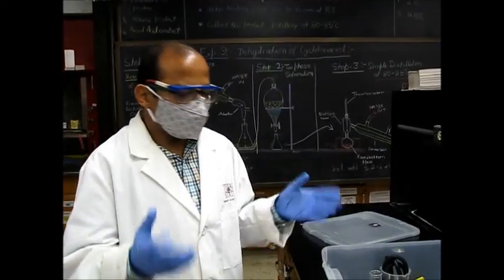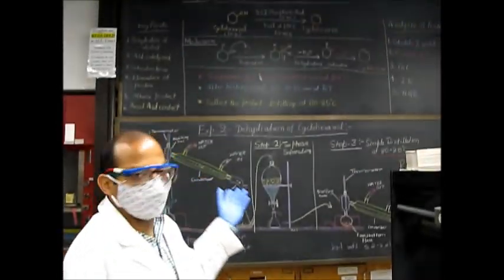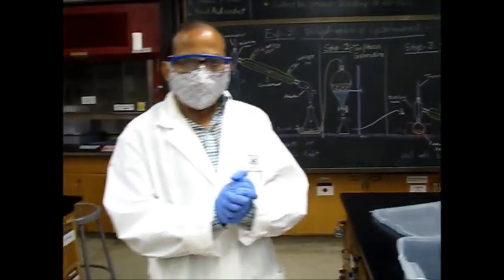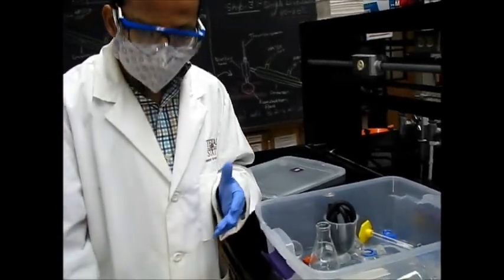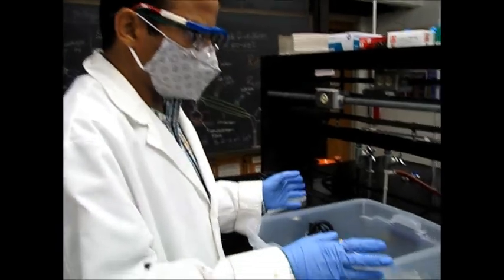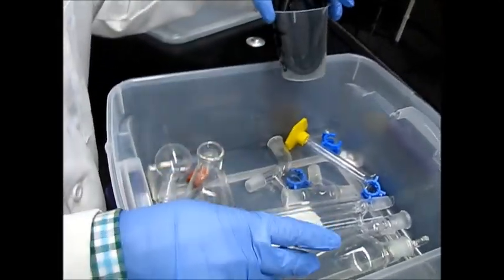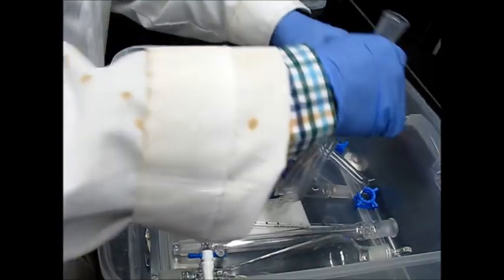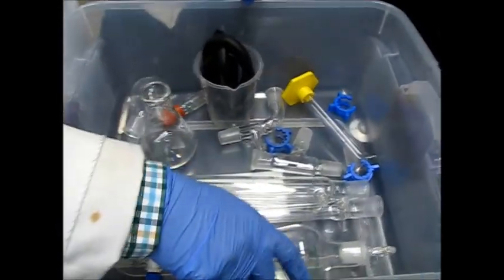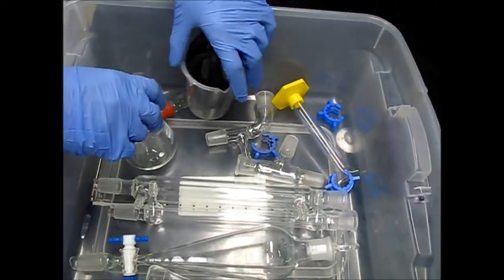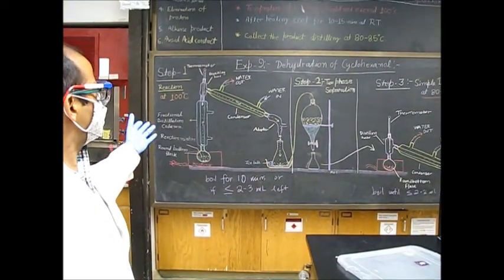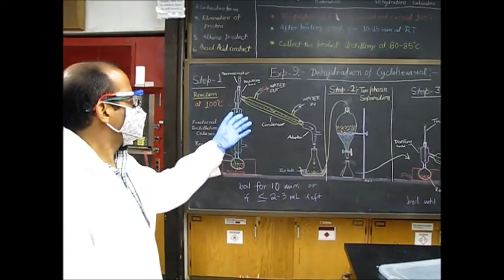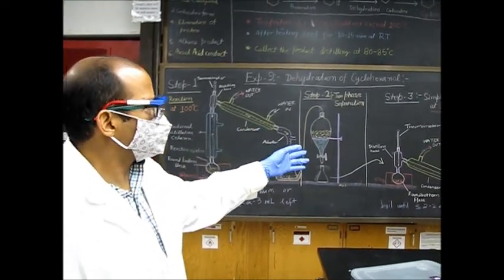Before we start this lab — dehydration of cyclohexanol — we need all our protective equipment: gloves, goggles, mask, toe-covered shoes, and lab coat. Here is our bin with many glasswares. This is the Hempel column for fractional distillation, this is the condenser, separatory funnel, and round-bottom flask. This bin has all the glassware for the three different techniques: fractional distillation, two-phase separation, and simple distillation.